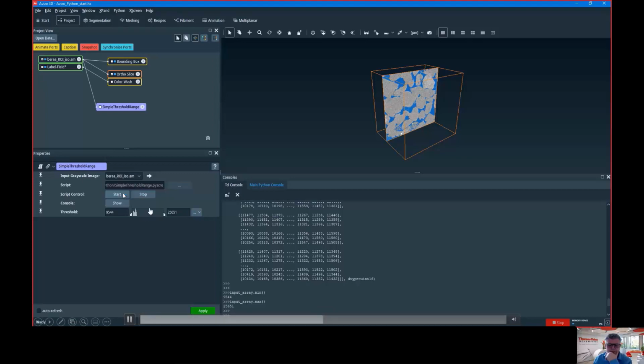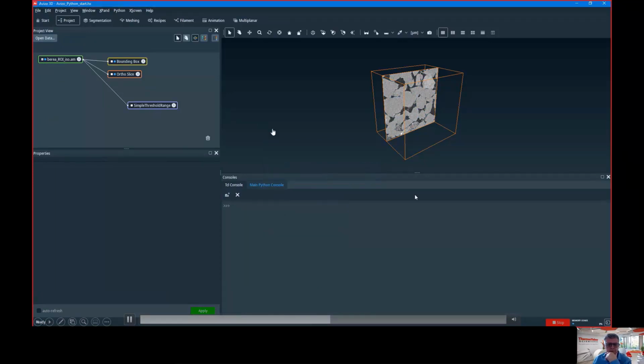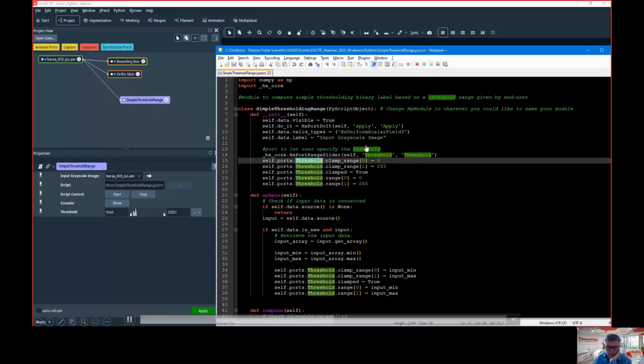Jump a little bit. Yeah, so I connect and magically, let's say not magically, it's the code doing it. The code is updating min and max. So this is what the end user expects. And then this was a previous data set. I don't need my console anymore because now I'm really working with the file, with the script.